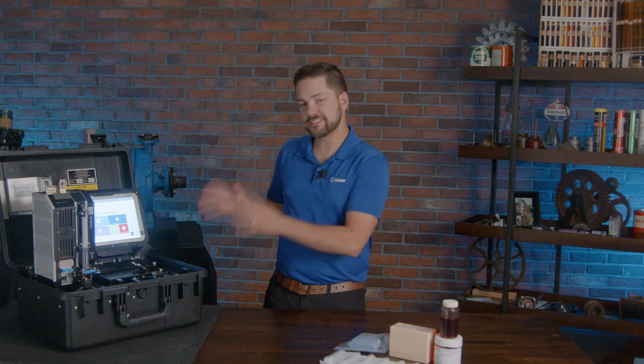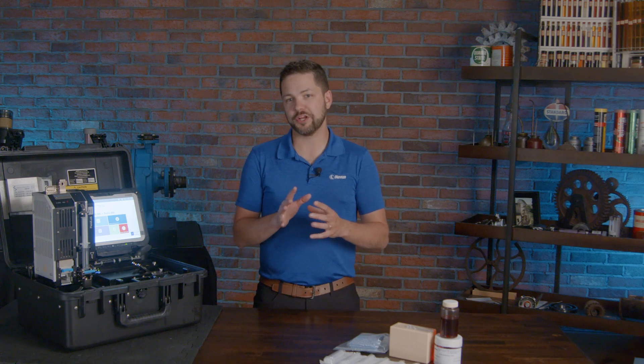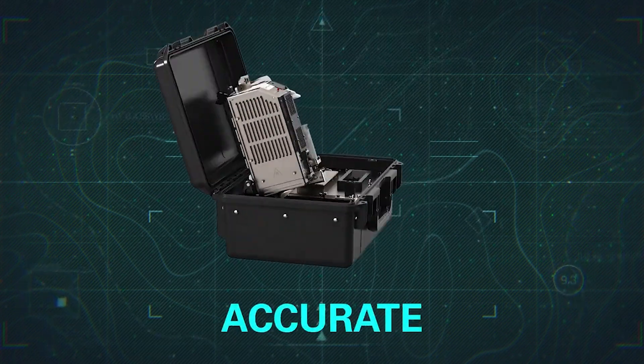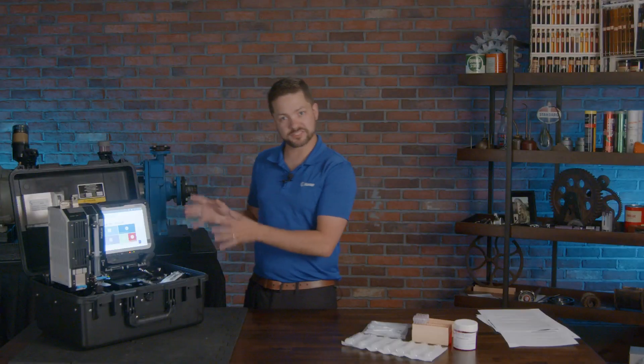Oil analysis and building an oil analysis program is well understood as part of a larger lubrication program, and many industries already recognize it alongside other condition monitoring. This has been designed to answer the needs of industries where you need to make quick decisions — you're not able to wait for data to come back from a laboratory. Critical machines can't wait. You need decisions made within minutes, and we can get those answers here within five or ten minutes.